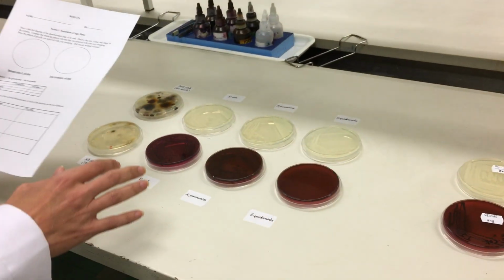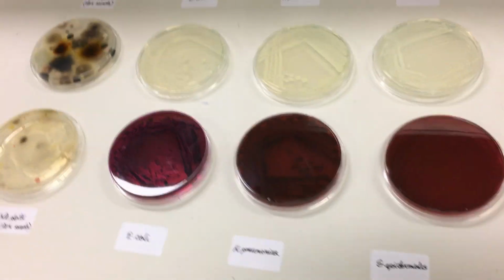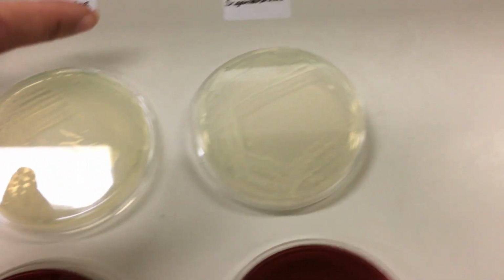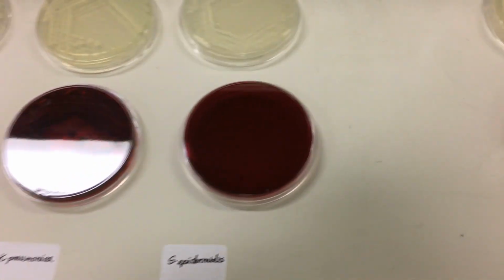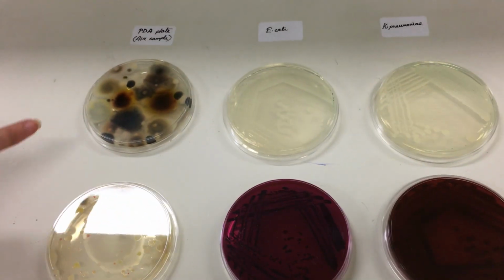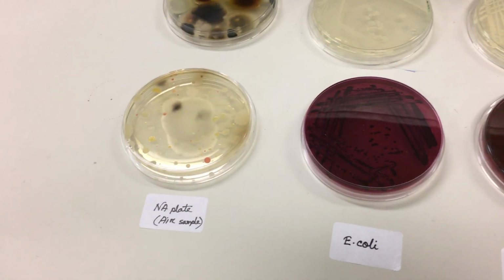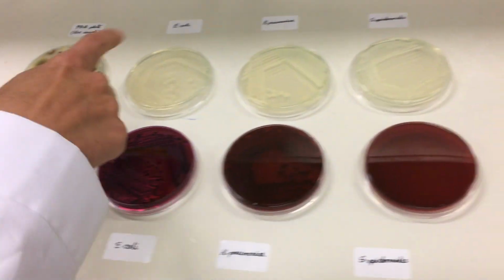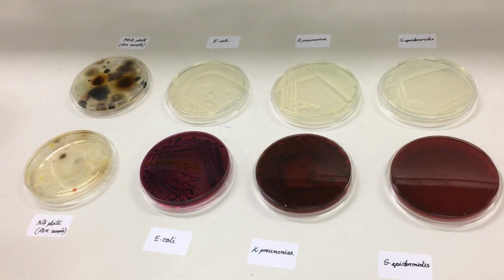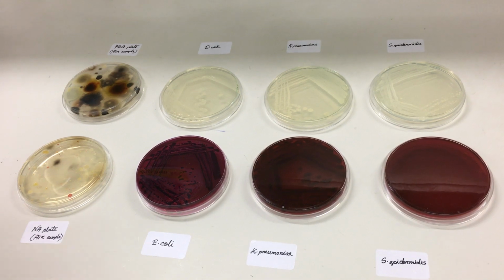So these are the plates that you're expected to see this week. Sanjida, can you please just show them what they're expected to see? So we had E. coli, Klebsiella, Staph epidermidis, and nutrient agar, and also EMB. And we had two empty plates that you filled with the PDA and nutrient agar. And then you were supposed to streak the selected bacteria on these plates and keep these two plates to collect any bacteria or fungi from the air.